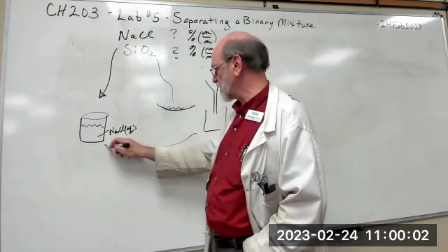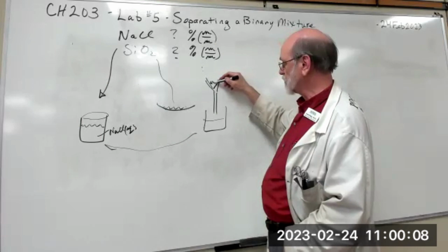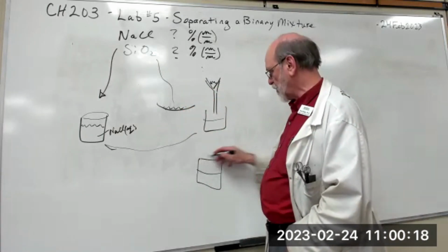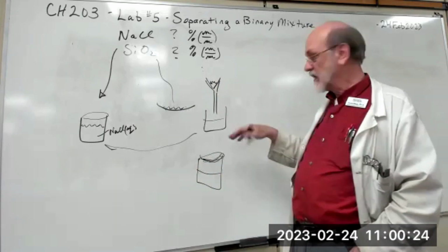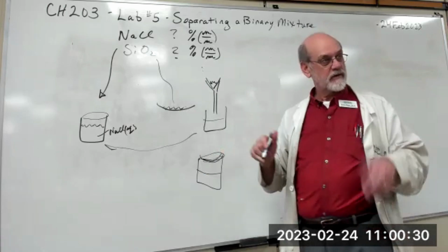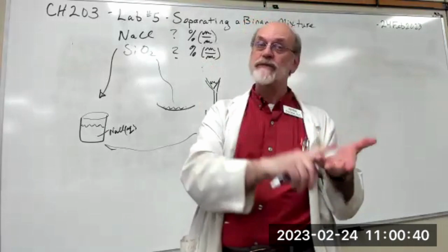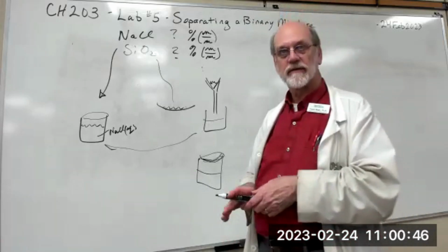Actually, this is the same beaker as that one. What's behind in the filter paper is your sand. So you take that filter paper out, you put it on the watch glass, and then you put it on another boiling water bath here. That heats it and drives off the moisture. And now you have dry sand in your filter paper and the watch glass. If you have the weight of the watch glass plus the filter paper first, then after it's dried you weigh it again, the difference is the weight of the sand. Okay, that's the procedure.